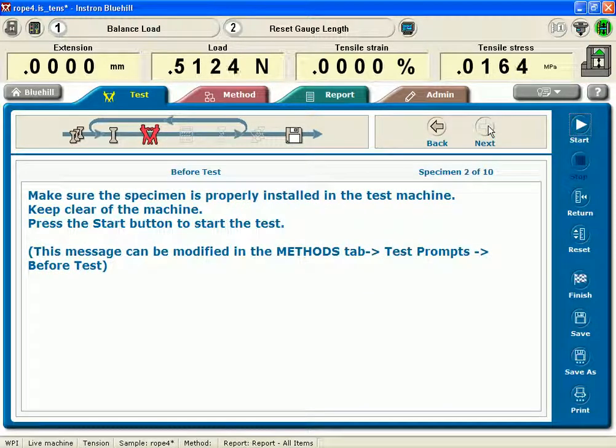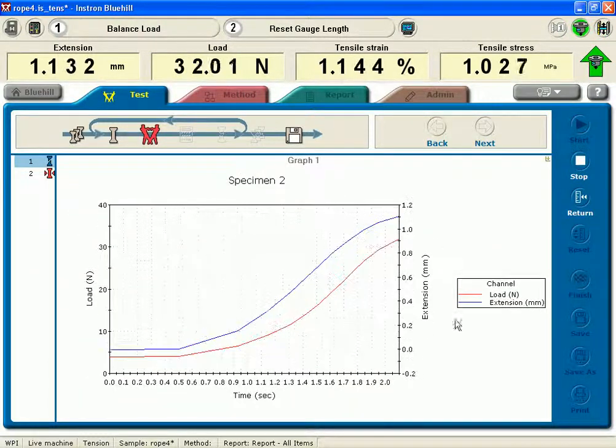I have my safety stop set so it won't hurt the grips, and I have my gauge length set. I'm going to set my tear load to about 5 newtons. Reset my gauge length, and I've already measured that out. I have my safety stops and my safety shield. I'm going to run a test here.